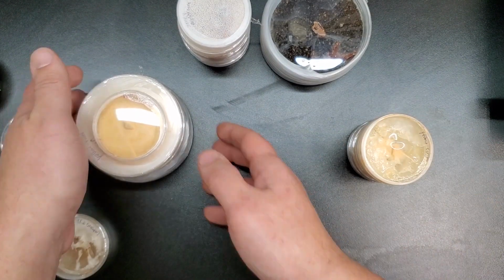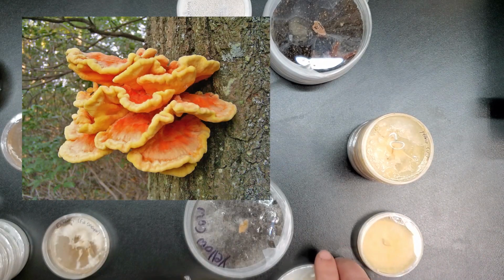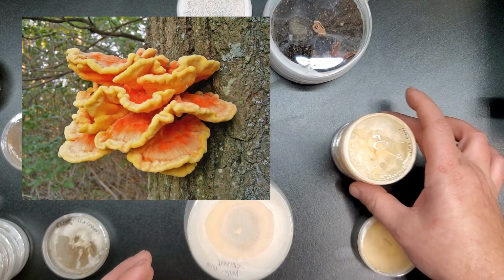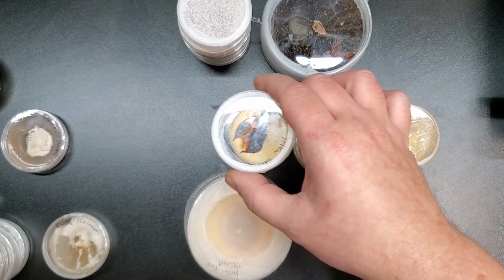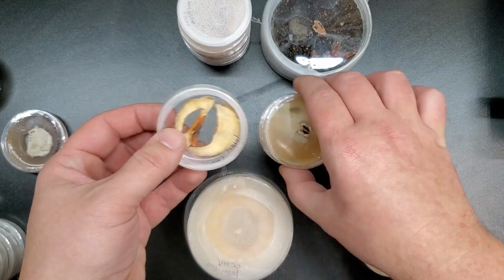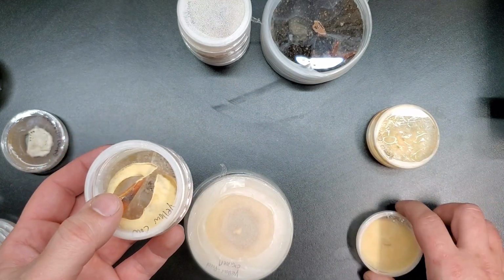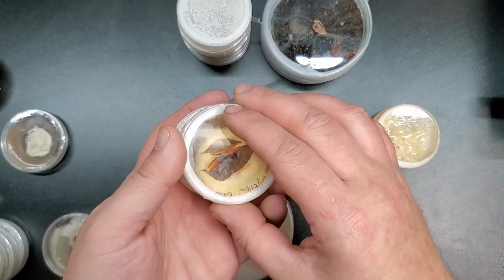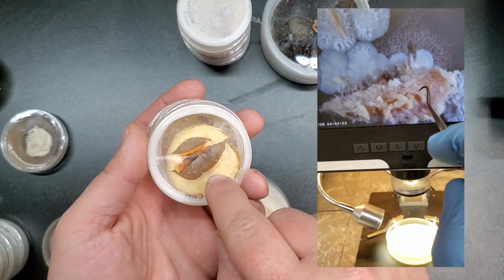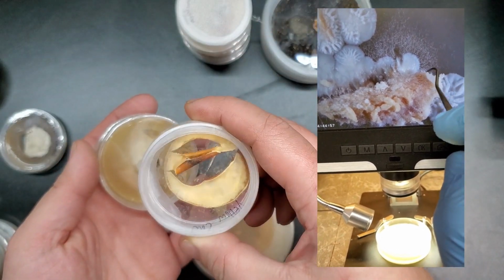So let's move these over here. Now these are the chicken of the woods, the yellow chicken of the woods mushroom samples that I have. And as you can see, this one's a little worse for wear. These are the original ones that I inoculated. I think I just threw one of the other ones away because that one was so heavily contaminated. This may have been the one that I showed how to salvage a Petri dish that's contaminated. So that's why I didn't really worry too much about this one.